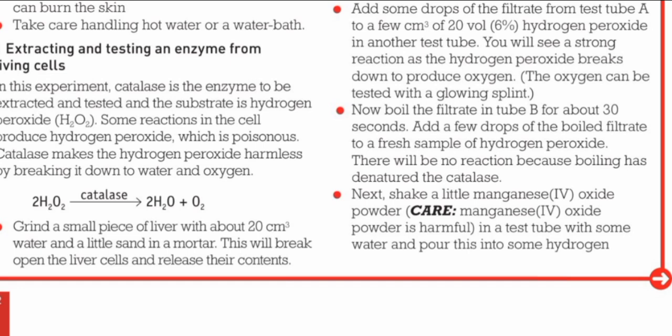This is a very important concept in which we will boil the filtrate, then add it to hydrogen peroxide again. No reaction occurs. Why? Because the enzyme is denatured by heat. Yes, very good. If we use this filtrate in a boiled condition, then the reaction will not proceed.